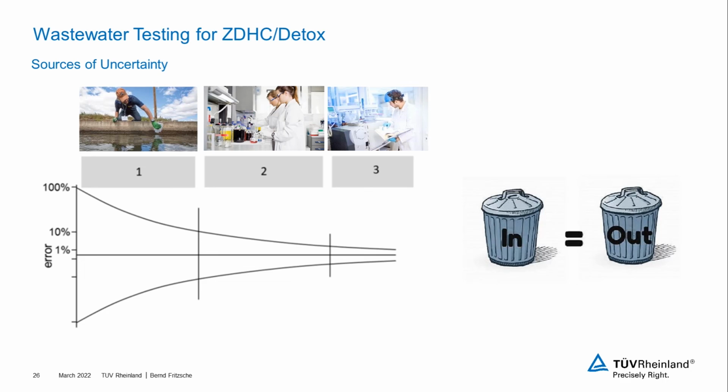But the fact is that errors we make during sampling cannot be in any way bettered during the rest of the process, which includes sample preparation and the actual measurement. For example, if the wrong preservation is used for the storage of the sample, or the temperatures are wrong and our analyte decomposes during storage, we will not be able to find anything in the following steps. Therefore, in simple terms, we can also say garbage in, garbage out.